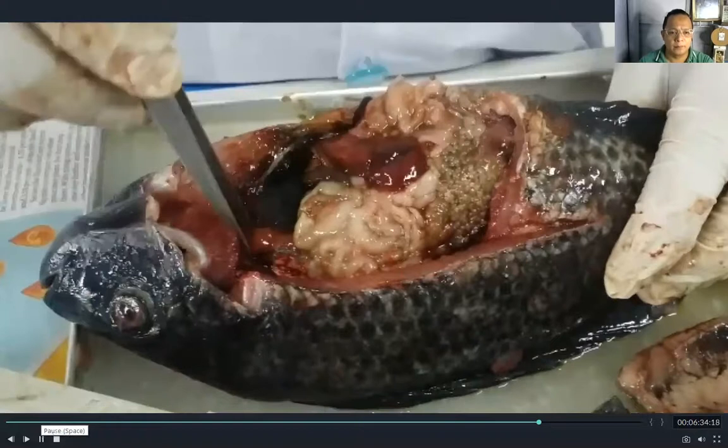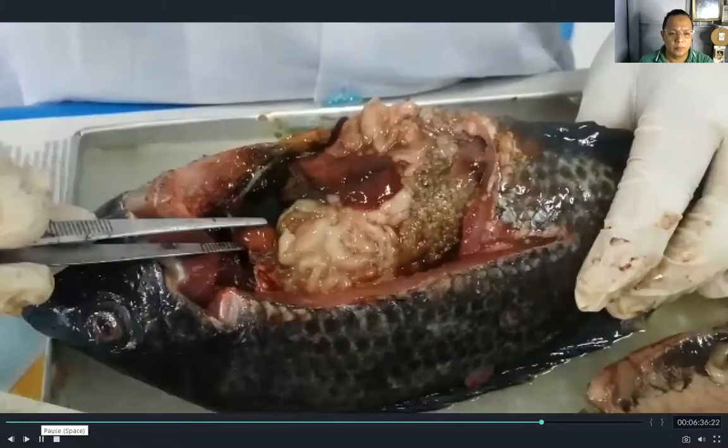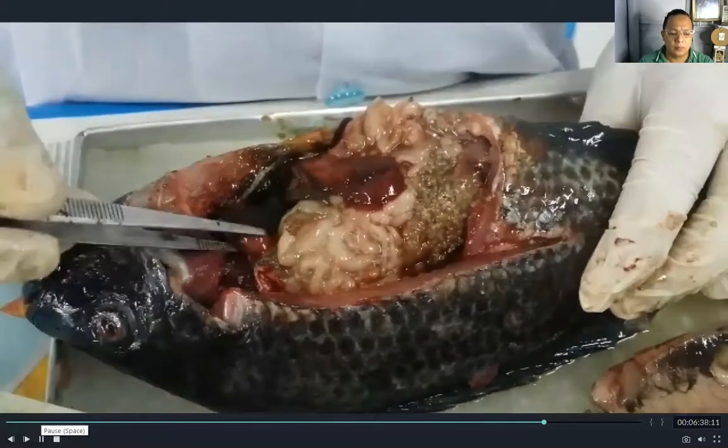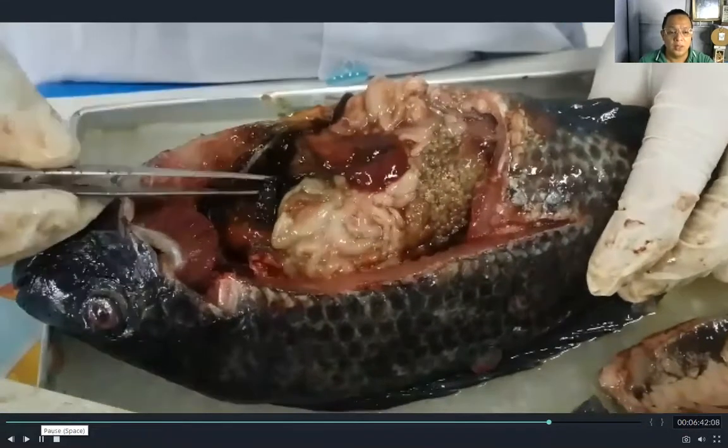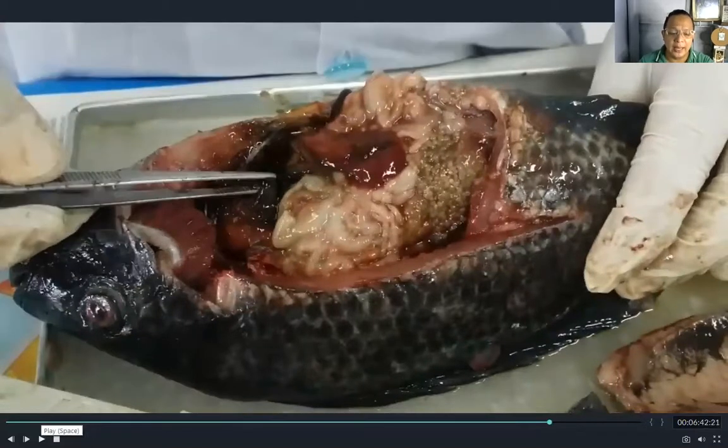This is the heart. This is the heart of the fish. The heart is the organ responsible for proper blood circulation and the transport of oxygen and food nutrients throughout the body of the fish.